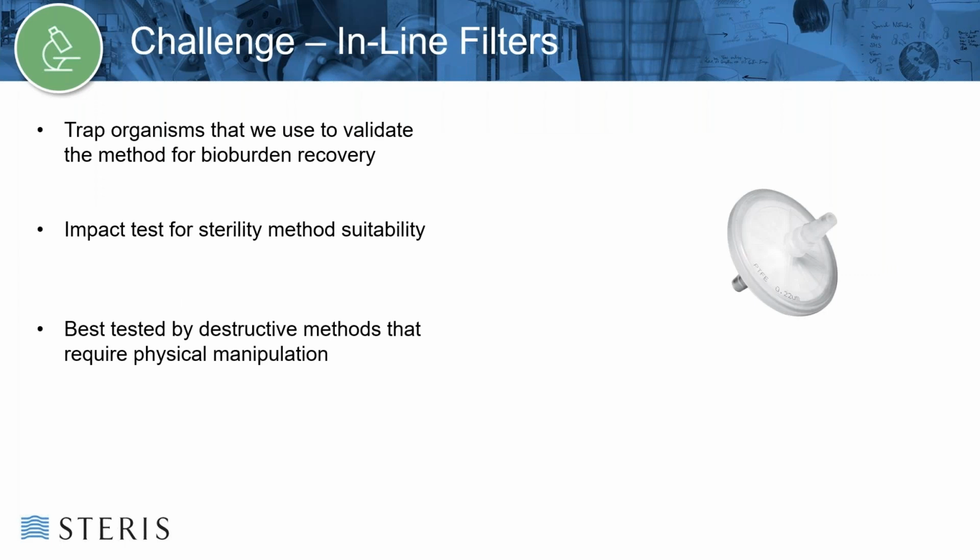Additionally, inline filters can pose challenges for testing. They are made to trap organisms, and they can trap the organisms that we're using to validate the method of bioburden recovery, making it difficult to get acceptable recoveries. Additionally, they can impact the test for sterility method suitability in that they limit where the organisms can go throughout the system. They can be limited to just a portion of the device, which is not a full challenge of all sections of the device.